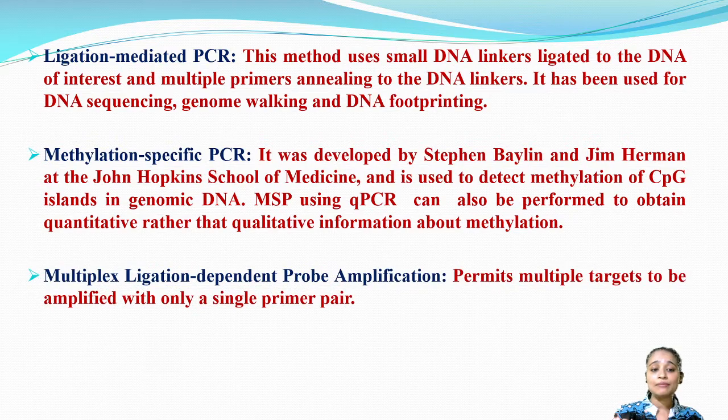Now what is multiplex ligation dependent probe amplification? It permits multiple targets to be amplified with only a single pair of primers. Here you use only a single pair of primers, with which you can amplify your multiple targets.